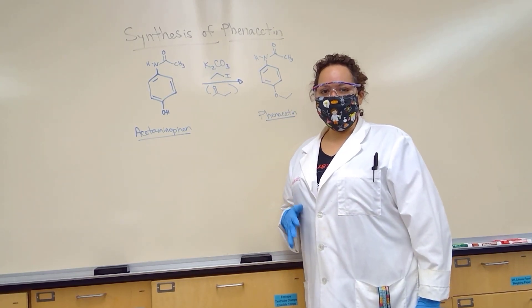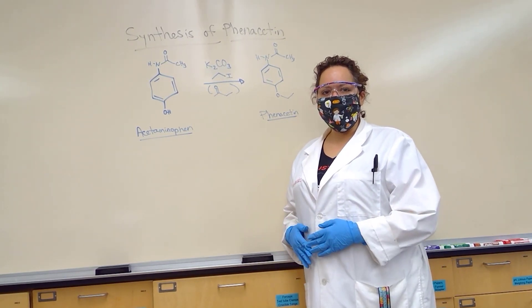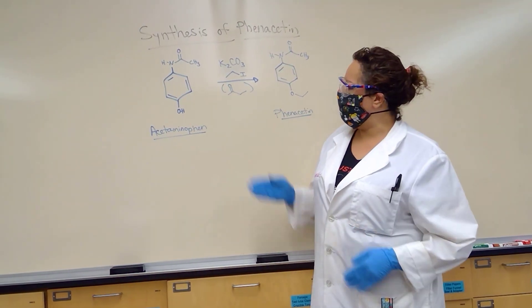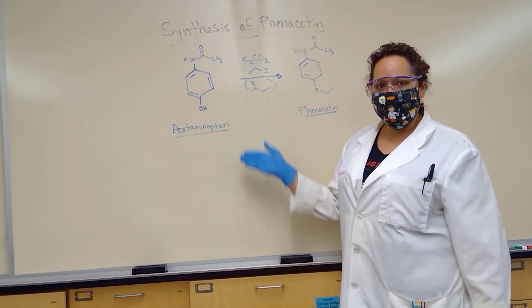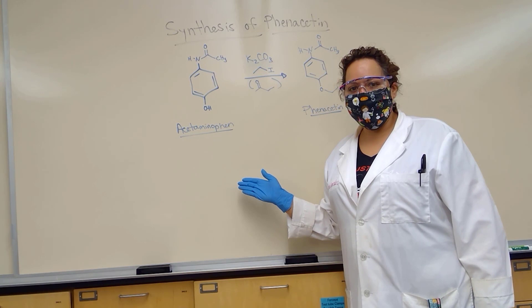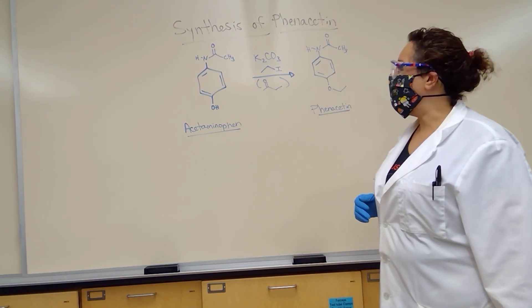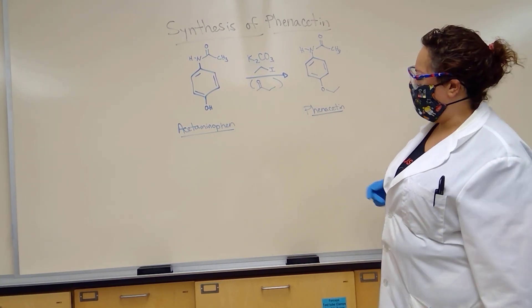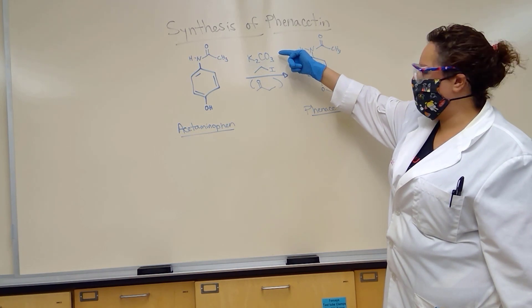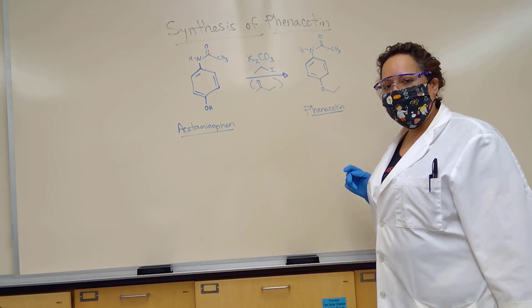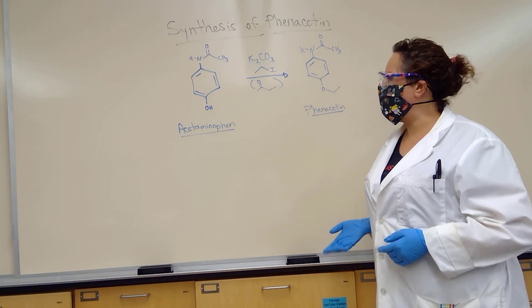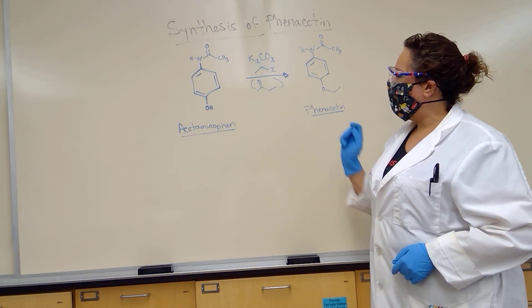Today we are working on the synthesis of phenacetin from acetaminophen. We will be starting with the compound acetaminophen, which is sold under the commercial name Tylenol. We will be reacting this compound with a base, and our base will be potassium carbonate. Our electrophile for this Williamson ether synthesis will be ethyl iodide.